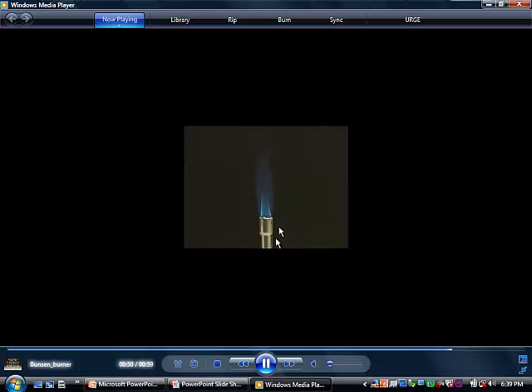This makes the flame bigger or smaller. I'm going to pause for a second. This is actually a fairly hot flame because it's got this bright blue cone.